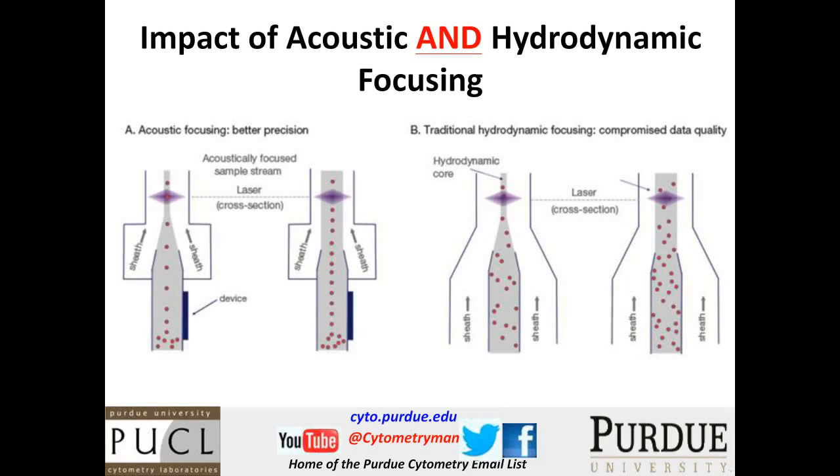But if you increase the pressure on this to go faster with traditional hydrodynamic focusing, you don't end up with a good situation. And we've all seen that in our systems, that you lose some of the integrity or the quality of the data. So what's the difference in an acoustic system?